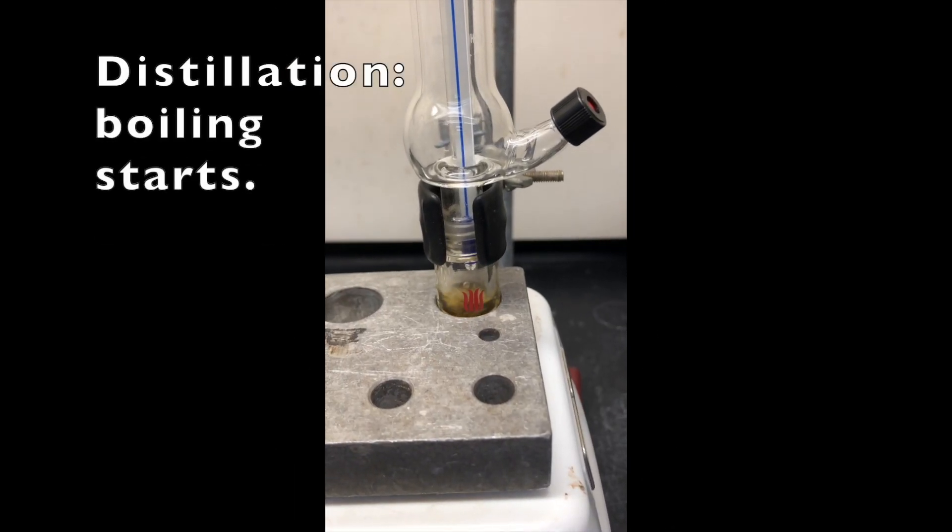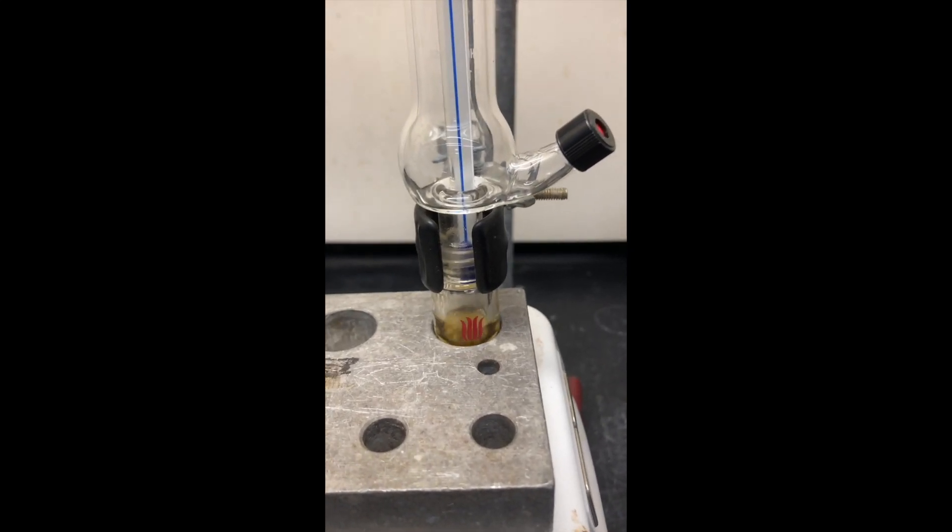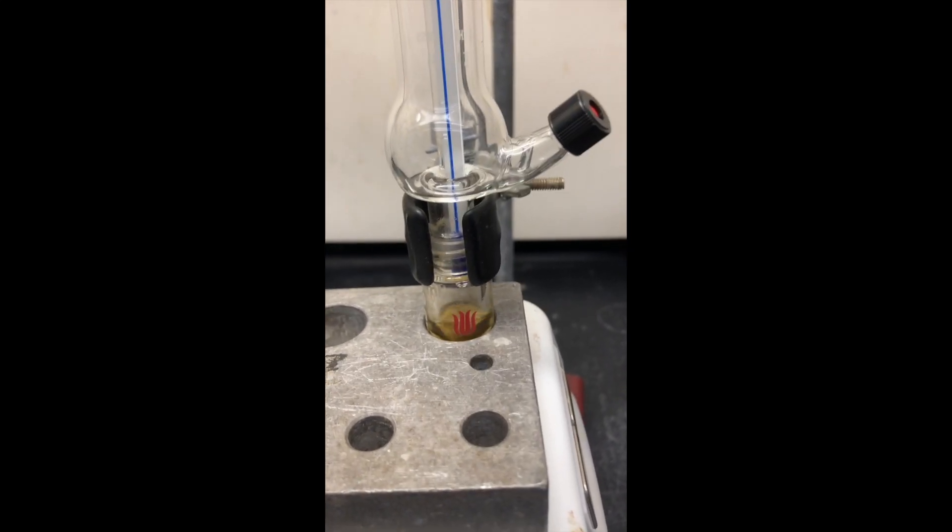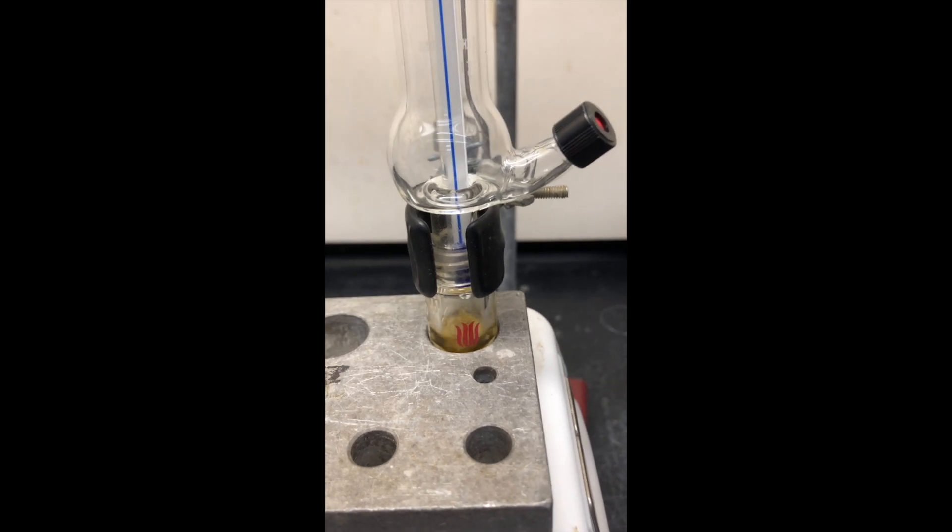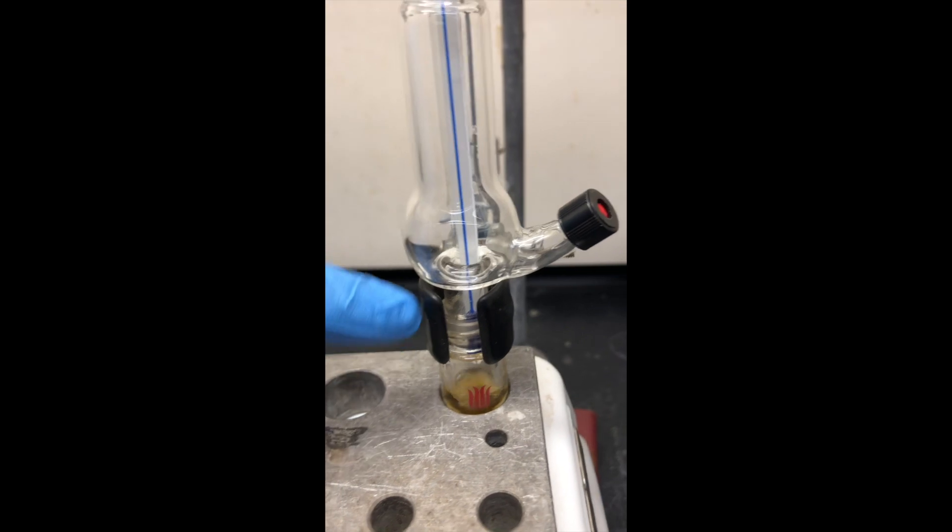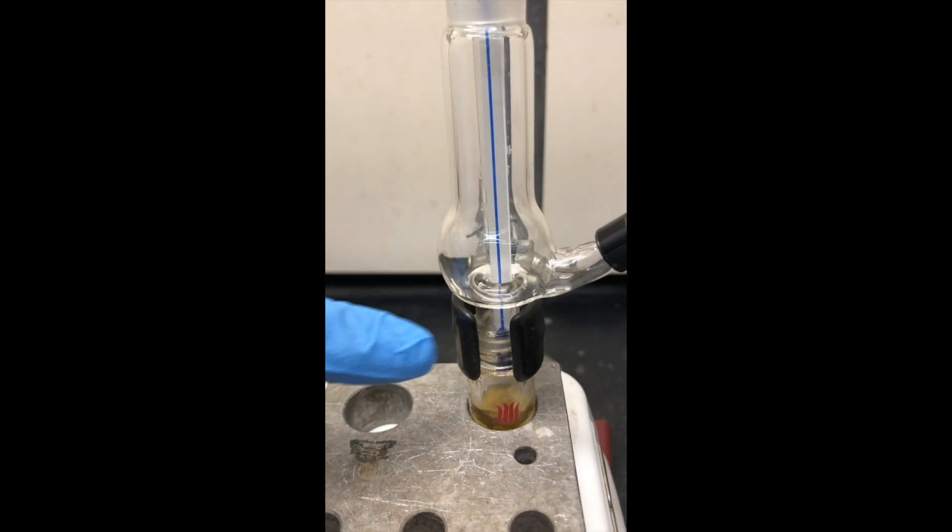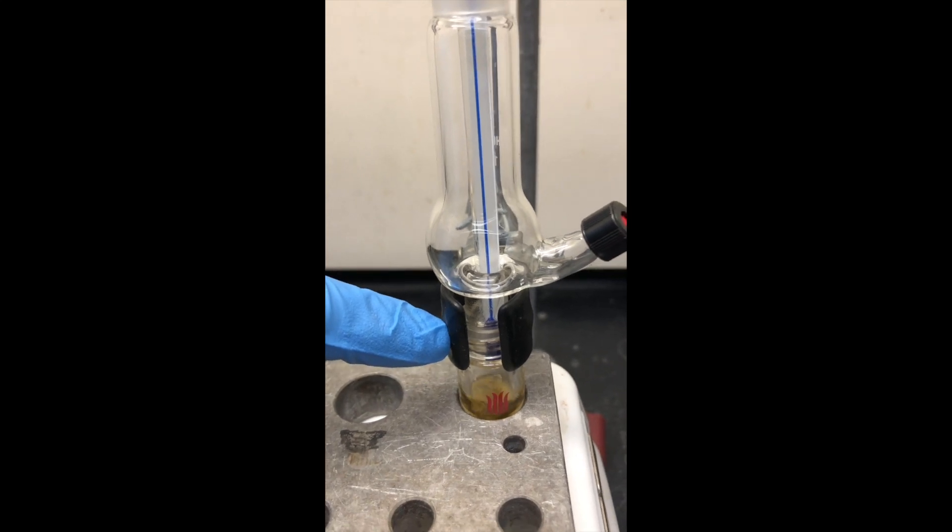So we've started boiling after about 10 to 15 minutes of heating, got a nice steady boil but it's not refluxing yet. There's not much in the way of vapor making it up into here. Eventually the vapor will make its way up into the upper section. But for right now, the vapor really hasn't made it much past the thermometer bulb at the bottom.